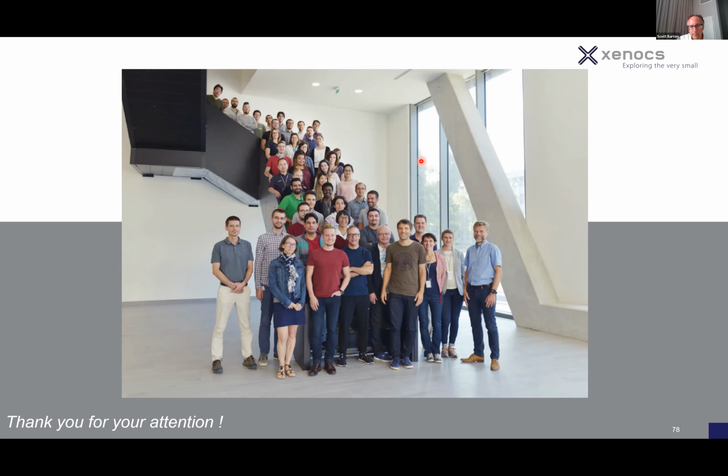Hopefully that's good. Okay, last from Ojo. Can SAXS be used to study the profiles on passivated steel surfaces? We might need more detail on that, but yeah.